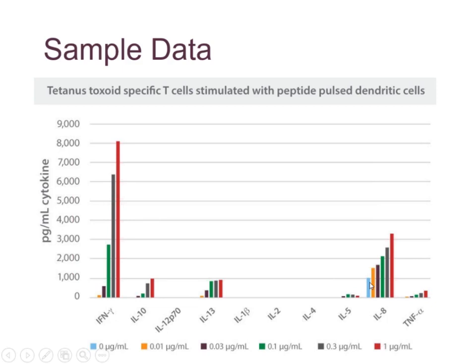There's also an increase in IL-8 production, but what you'll notice with IL-8 is that there's 1,000 picograms to begin with. So this is something that has the highest background of any of these 10. And you'll notice that these are just plain absent. IL-2, even though it's thought of as being something that would be made, tends to be consumed as fast as it's made, so it's not usually detected in any great quantity.